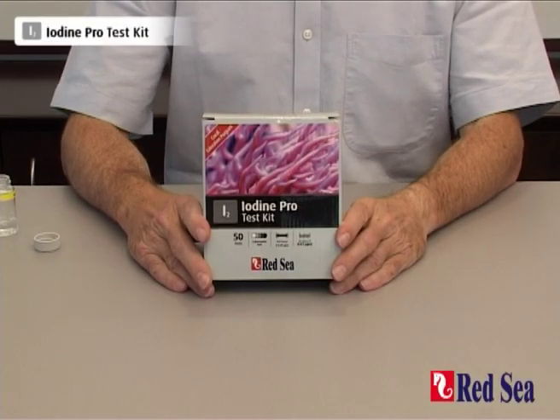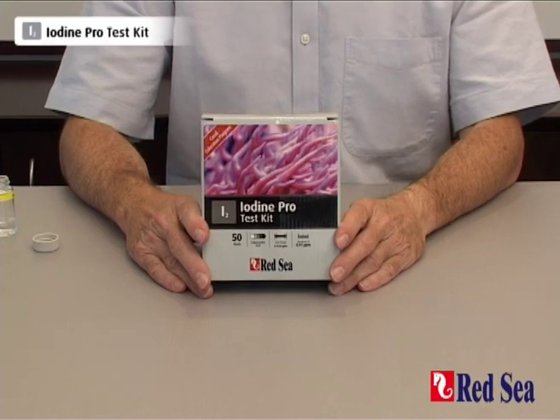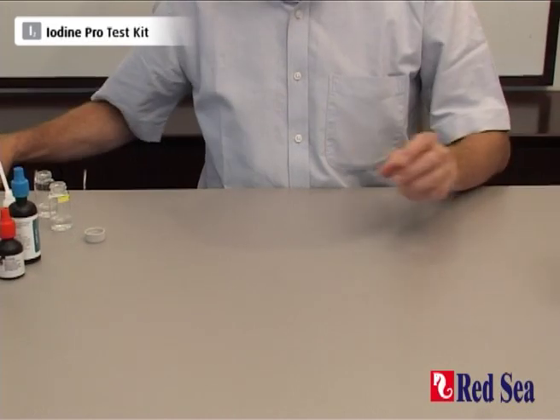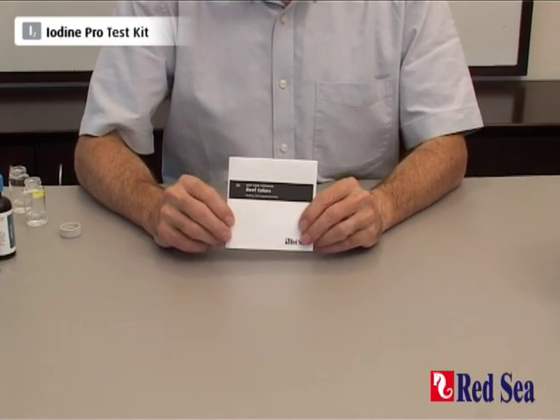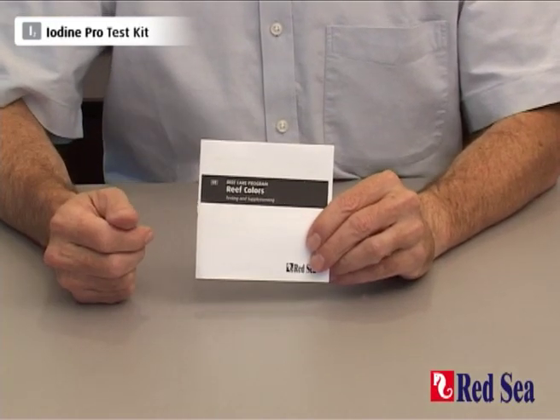Thank you for buying Red Sea's Iodine Pro test kit. The purpose of this video is to demonstrate how the test is performed. Before you do the test for the first time, make sure you read the instructions that are in the manual provided with the kit.